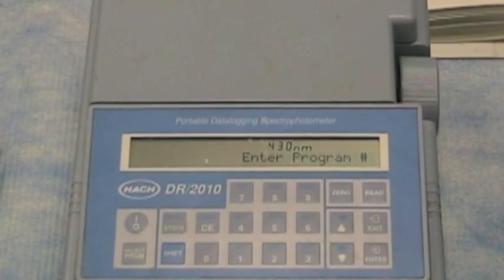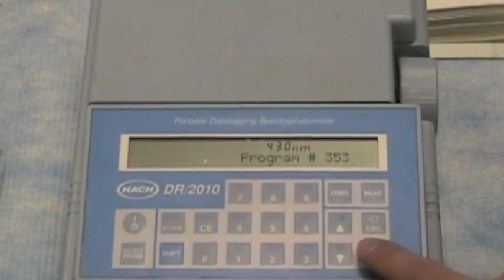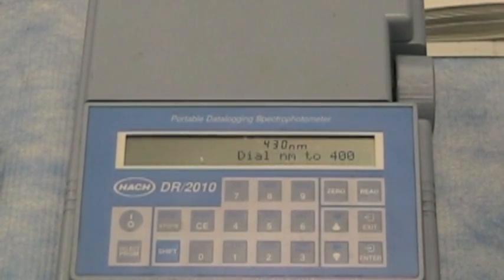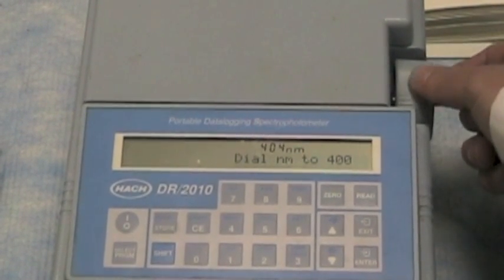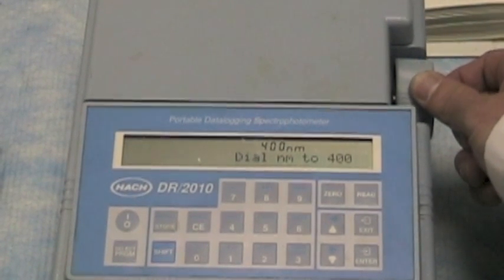The first step in the nitrate test is to set the program number, which is 3, 5, 3. Then you want to adjust for the correct wavelength using this dial to 500 nanometers.